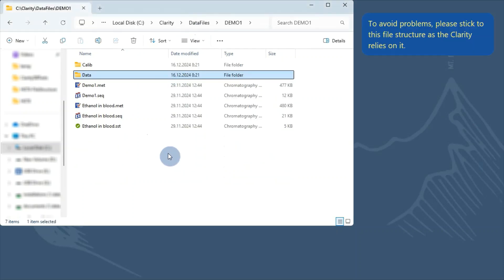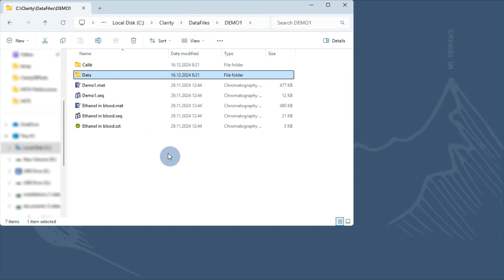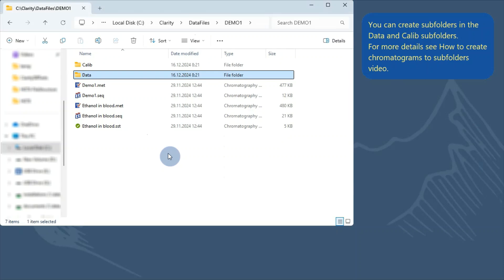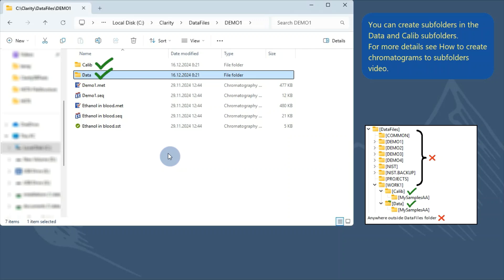We strongly recommend sticking to this file structure, because placing files in different locations can break links between files and cause unexpected behavior. You can create additional subfolders inside the Calib or Data folders to further organize chromatograms. Please do not place subfolders anywhere else. For more details, please see the video 'How to create chromatograms in subfolders.'